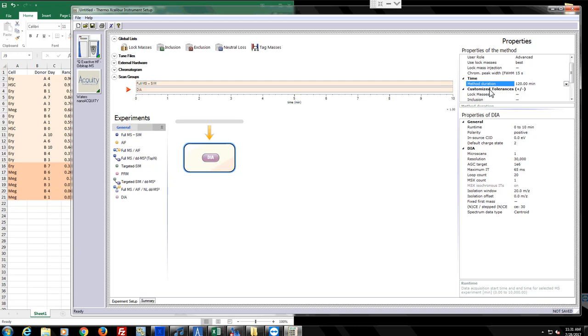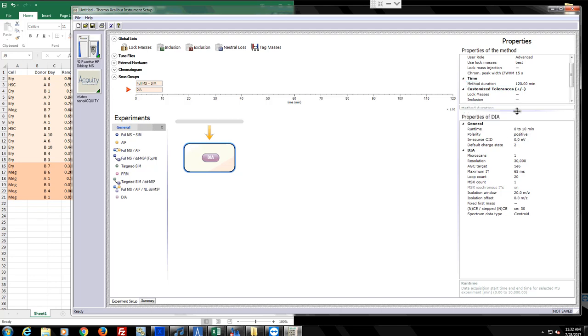Yeah. I'm not super familiar with this chemical mechanics, I'm not sure. But we could do that also, the scan range of the MS perspective. Yeah, so I see what you're saying. You're saying depending on the isolation, what's the scan range of the fragment ions that you measure set to. So I know on the Fusion series, which I've been using recently, you can actually define that. So I actually set it.